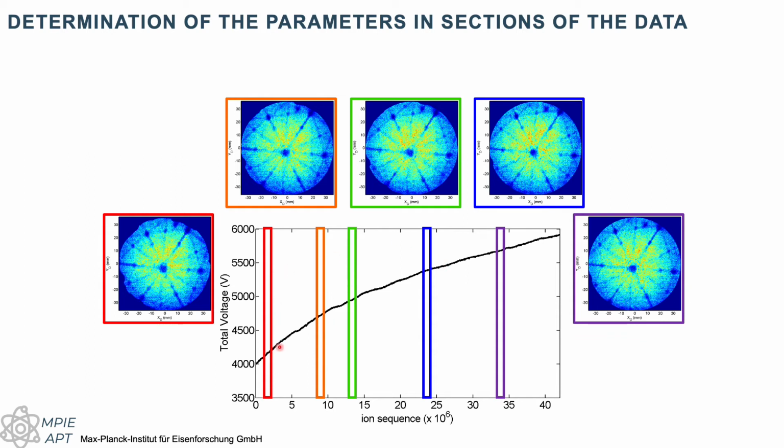If I take one single data set and look over the course of the analysis, can I see a change in the distance between poles, for example, that would be indicative of a change in the ICF? If I measure the change in ICF, can I build a reconstruction every time to get the right KF? And yes, you can. There's nothing preventing you from doing so.